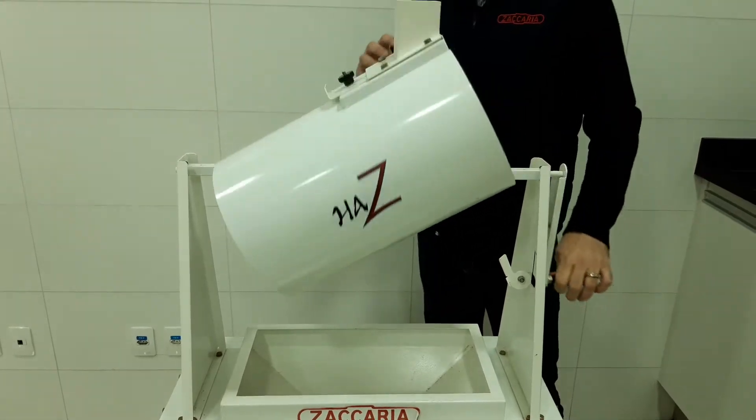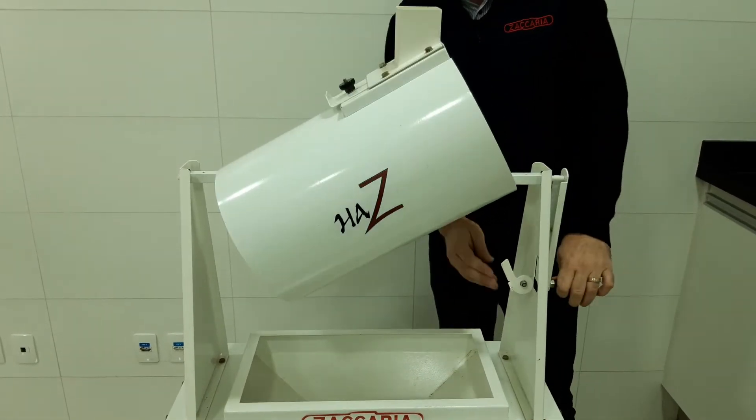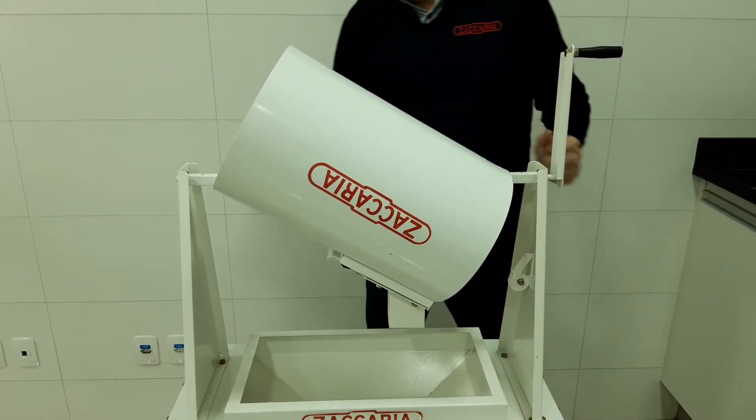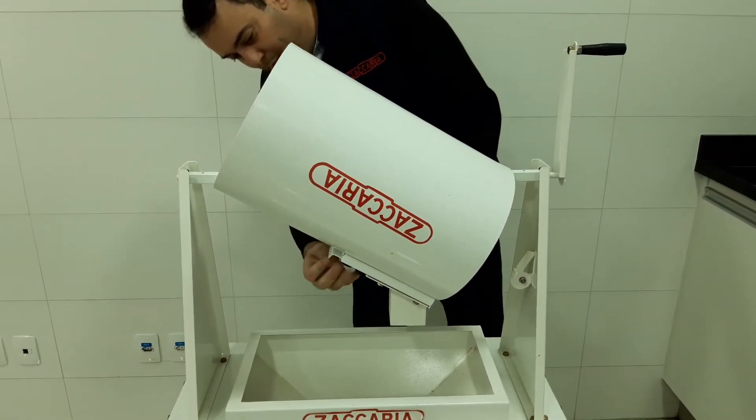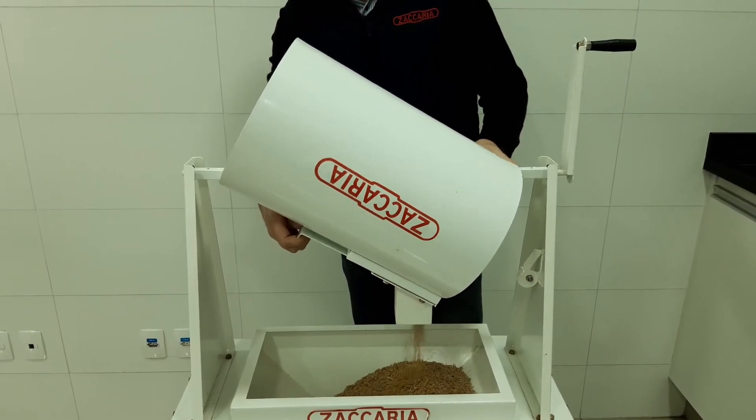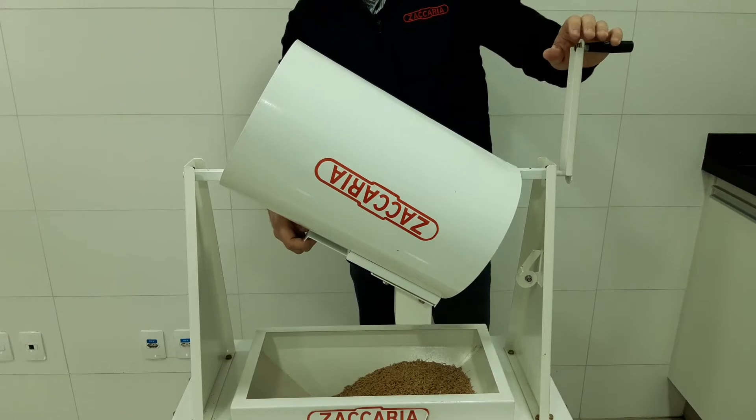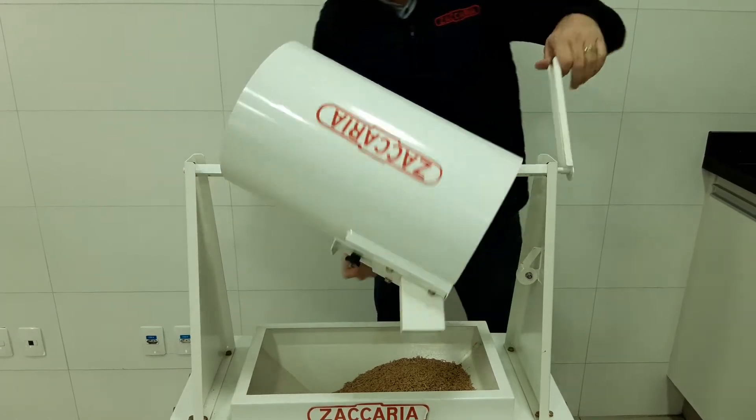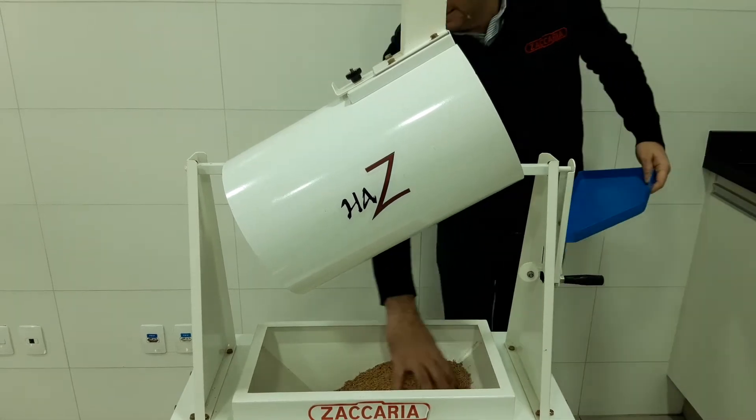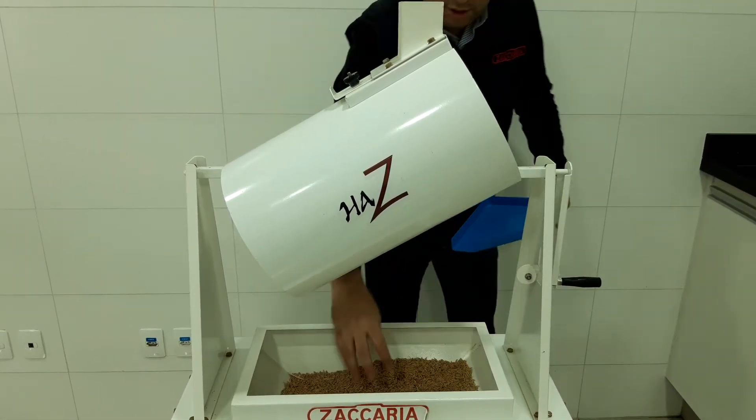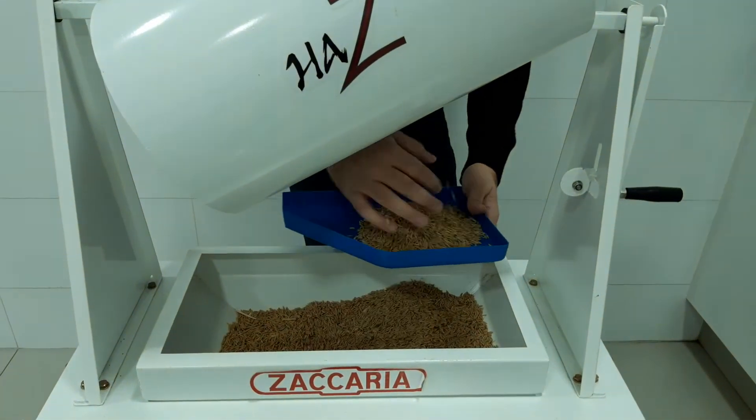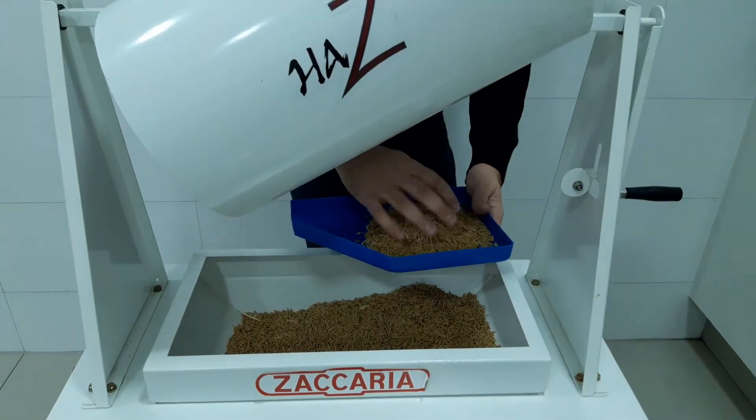So we use these procedures. Once we finish, we will unload from here. And then unload all paddy until here. And now this sample is homogenized. And then we can grab the sample from here to measure 100 grams of paddy.